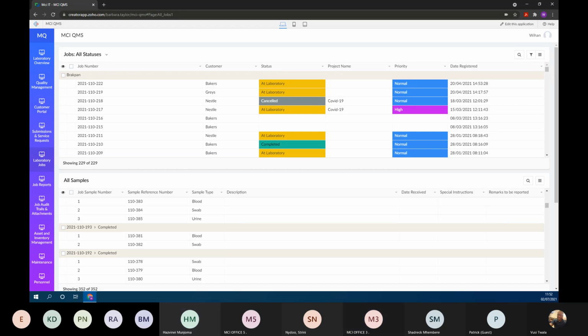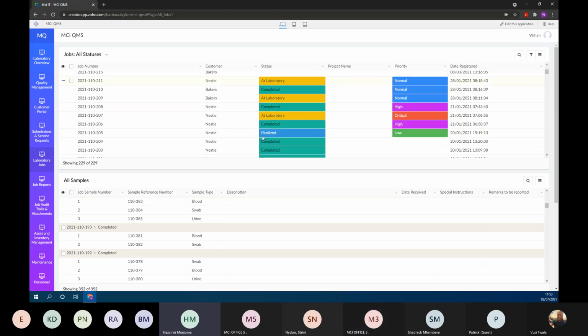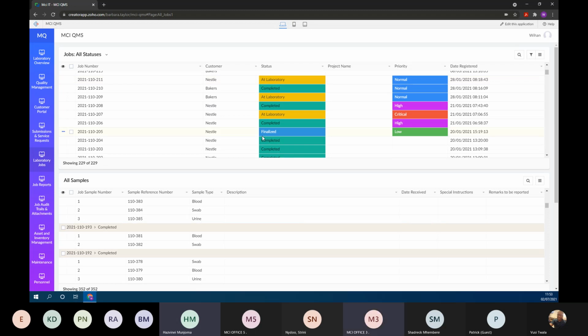Yeah, I think my question has been answered by Vusi, because I was just looking from the lab manager's point of view in terms of what can go wrong, because it's a smart system, but you need to know what's happening with all the other teams, like what you just explained. But just another question there is, what are the critical points of this system so that they are effective in a lab? So, sorry, what are the critical points? Is it the receiving? Well, I'm just looking at the workflow, or is everything critical, or how do we look at the whole workflow?